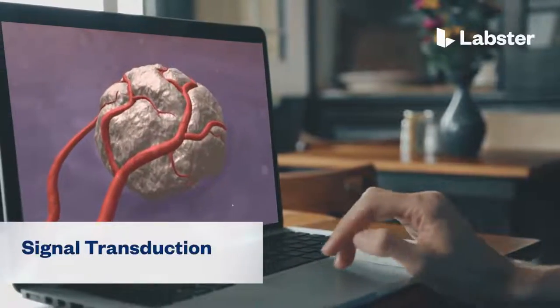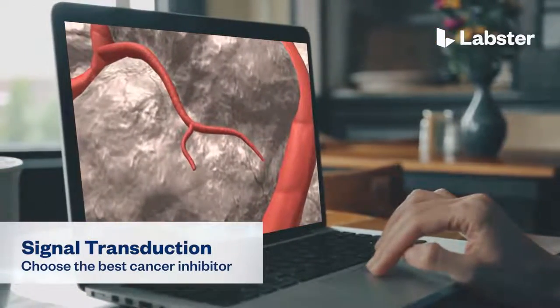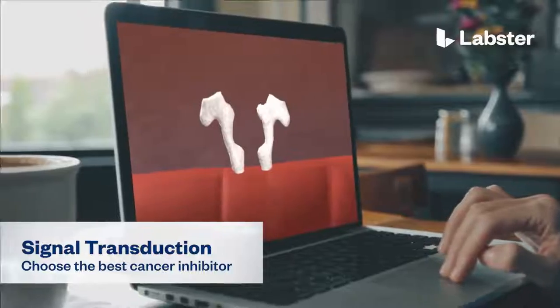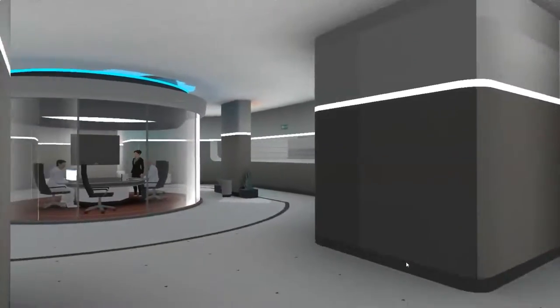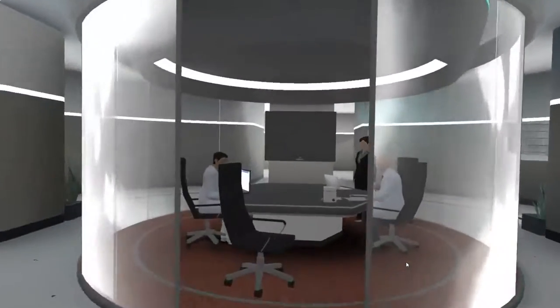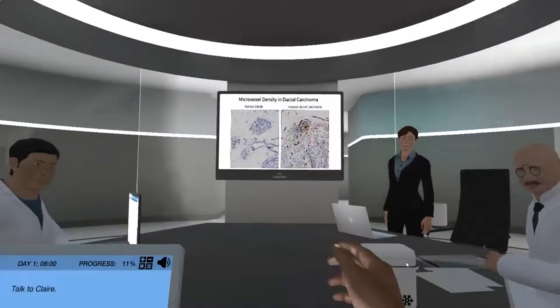In the Signal Transduction Choose the Best Cancer Inhibitor Virtual Lab, students step into a realistic lab experience where they can practice, learn, and explore science in an engaging and immersive way.